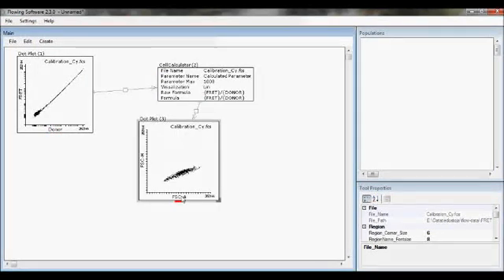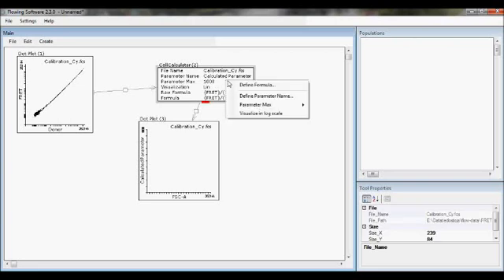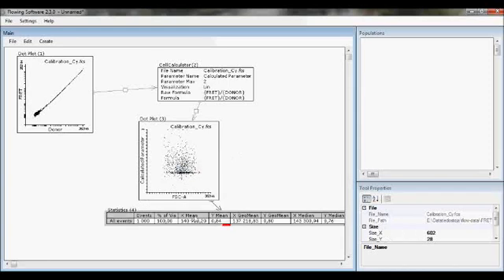If we connect it to a dotplot, then we can find the calculated parameter, and now we cannot see anything because the parameter max is 1000. Let's make it automatic, and now it's from 0 to 2, and the visualization is fine. So you can create a brand new parameter and rename it and get new values and, for instance, calculate statistics.